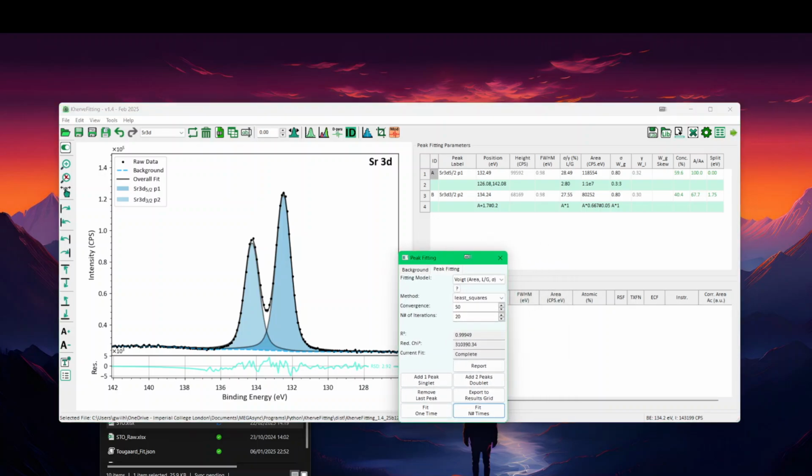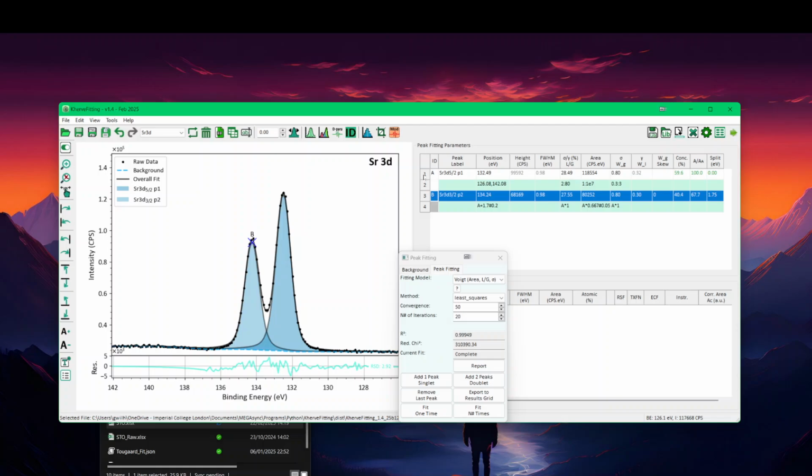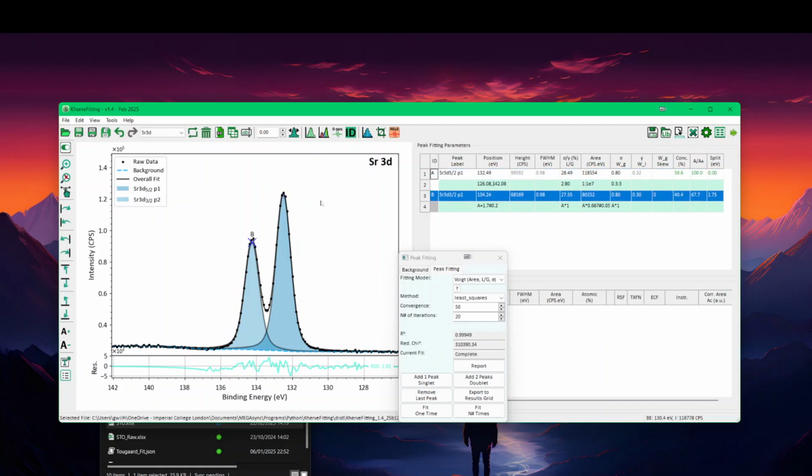So we came to section 7, which was this one, but you can also go to section 8 of the manual, and you're going to see moving the peak. Now, if I simply move the peak, I'm going to use the tab function. You can also click on 1 or 2, but use the tab, and you can see you can switch between the two.